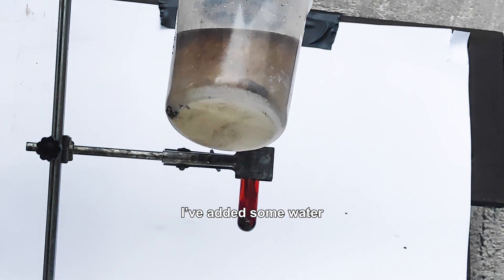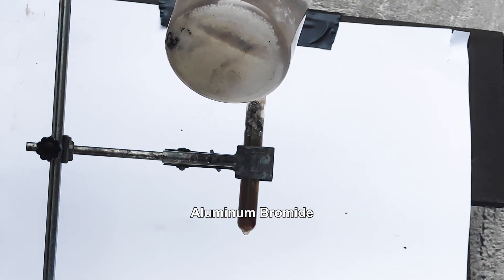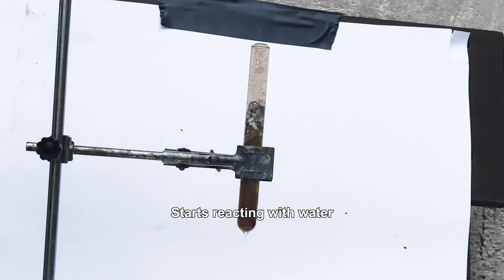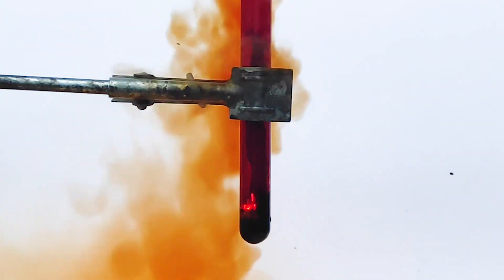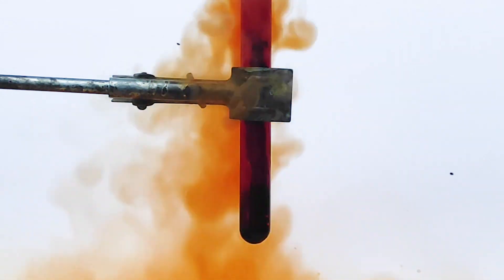After the reaction has been finished, I've added some water, and some fumes came out of the test tube. That's from aluminum bromide, which is the product of the reaction, starts reacting with water to produce hydrogen bromide. What's interesting is when we zoom into the reaction we can see something that looks like a miniature storm in a test tube.